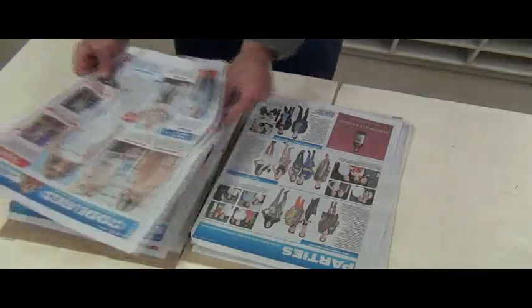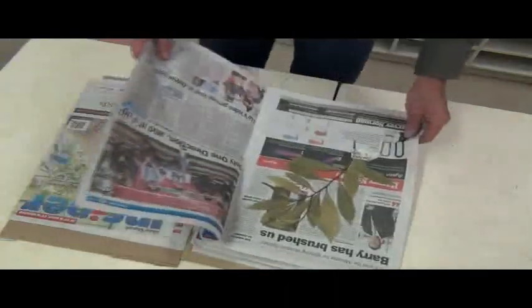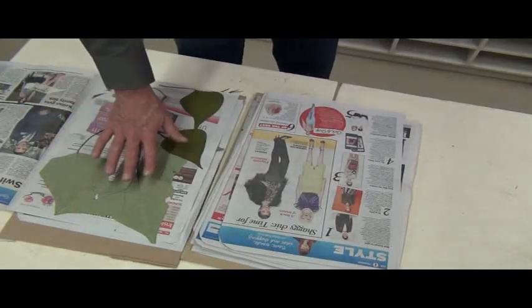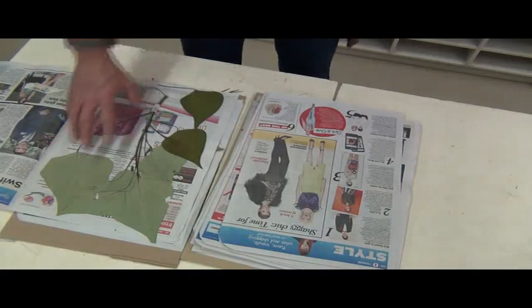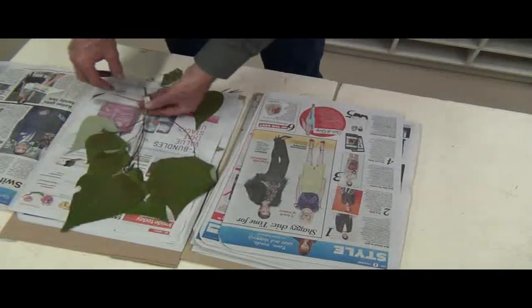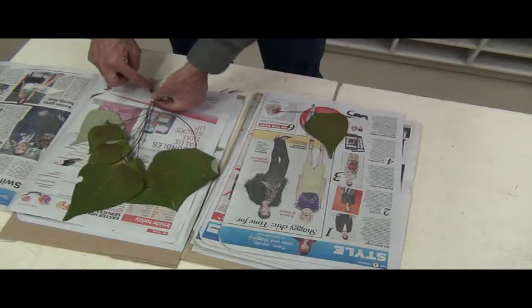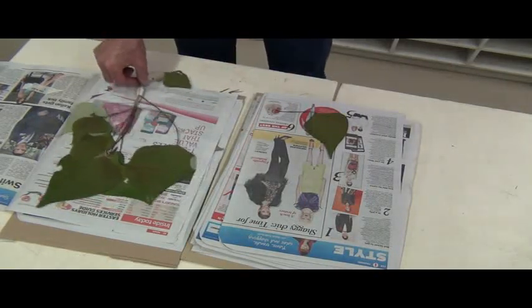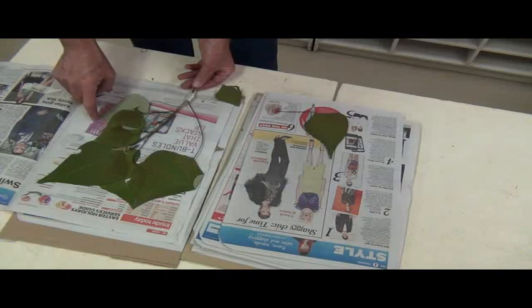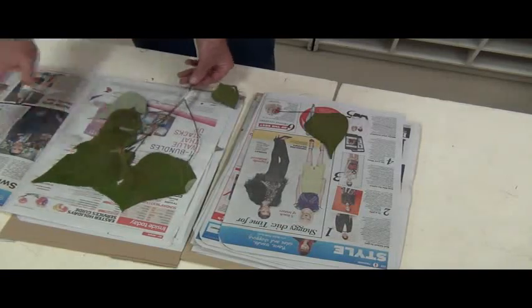Maybe with my predecessor you could have got away with these sterile specimens, but I'm afraid you've got — you're getting the pressing right, okay? The pressing is really nice. And here we've got a specimen where, if it was fertile, I would have been really happy with that, because that's a nice example. With this, I would have got rid of this, I would cut this off here, because you want to preserve that lovely tip. I would have folded that back, but I would make sure I had fertile material — but very nicely pressed.